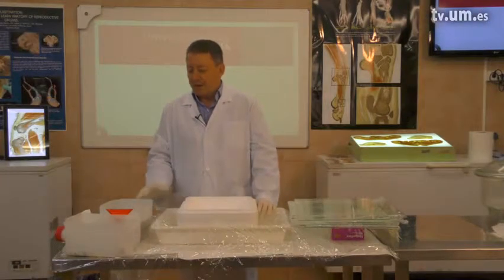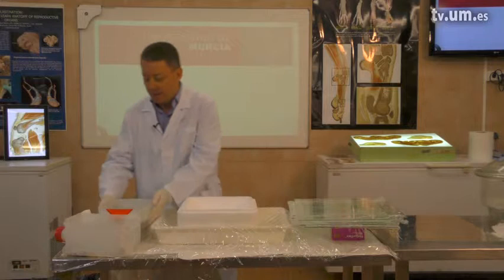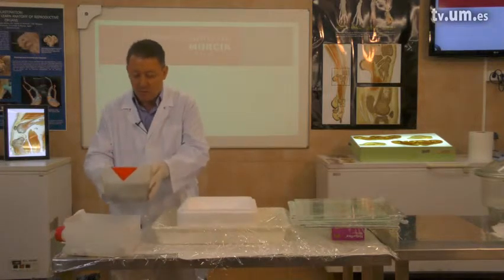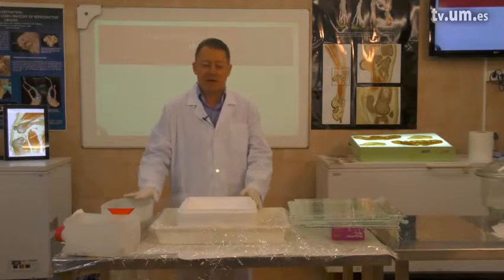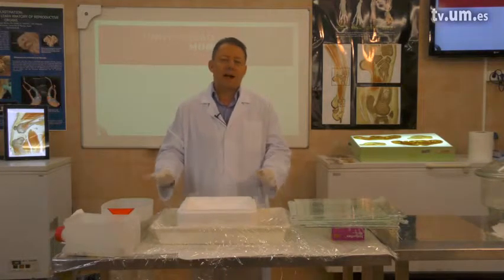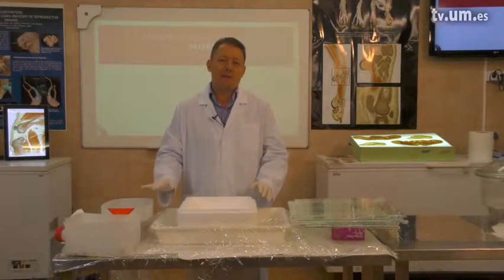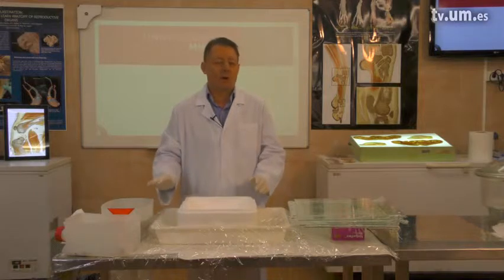After impregnation, we will have to remove our resin butt containing the impregnated slices and start with casting. Casting should be done immediately after impregnation, otherwise the resin could get solid.